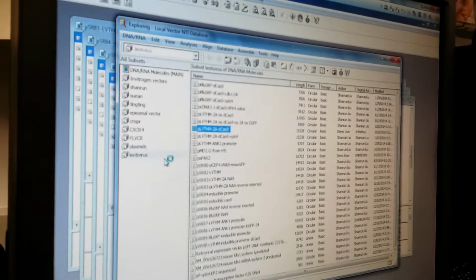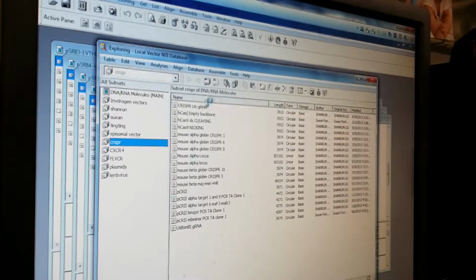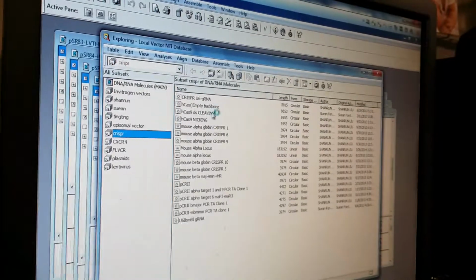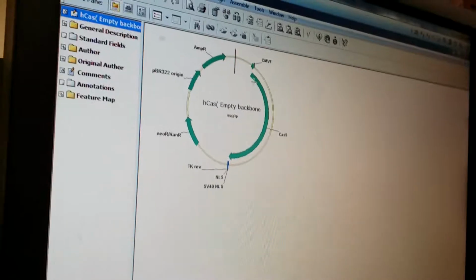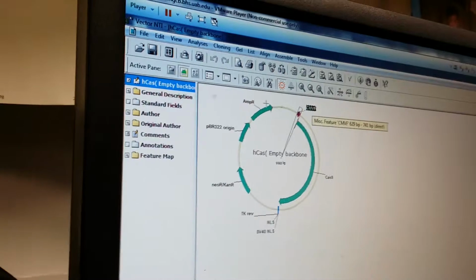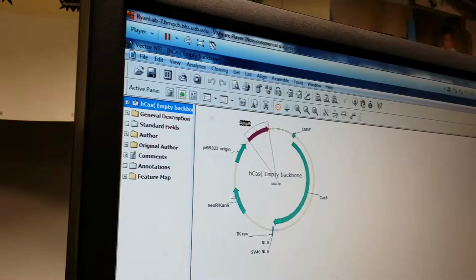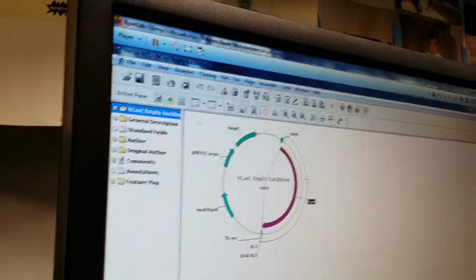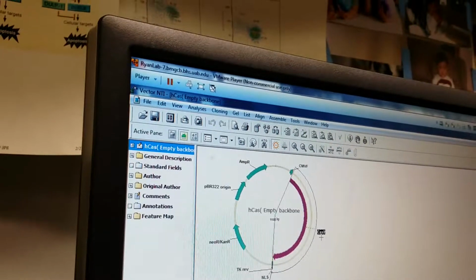You know the CRISPR, right? I have a CRISPR file here. They're all different, and there's a Cas9. Okay, this is a Cas9 plasmid. This is the Cas9 gene, and CMV is the promoter. This is the ampicillin resistance gene, and neomycin. So basically, this is Cas9. You can just electroporate this plasmid into the cells to express Cas9.